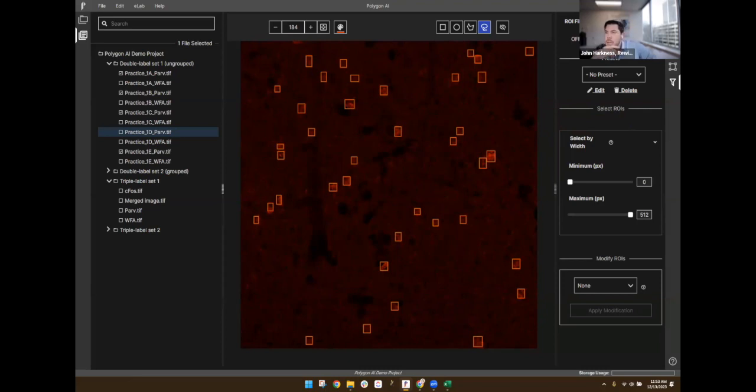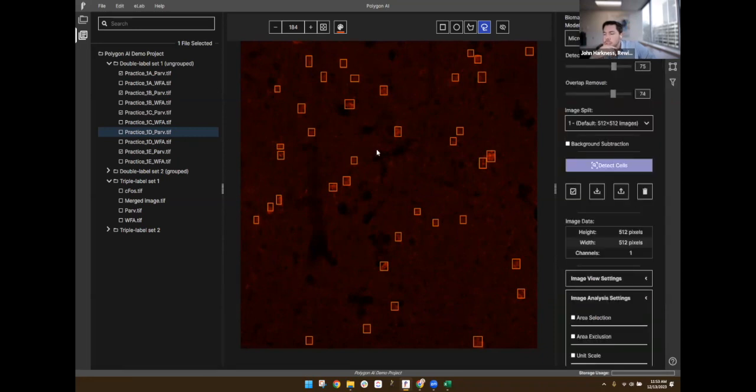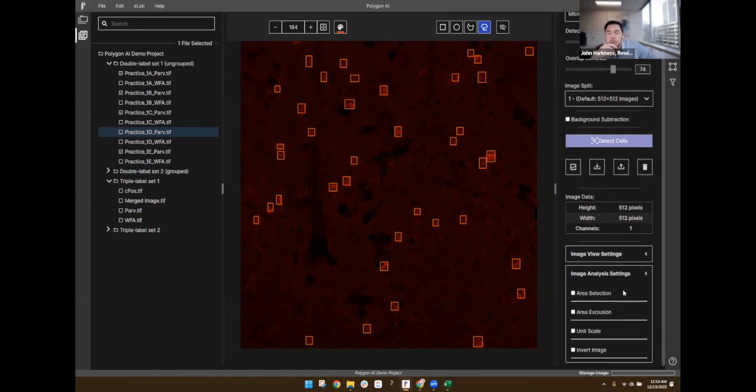Lastly, one of the tools down there is that area selection. I think that might be a good way to go about it. If you select just the inner area of the image, cutting off just a couple of pixels around the border, you're going to limit your detection to that. You can then turn off the area selection and the rest of the image is still there. So just for quantification purposes, you would not be chopping off other cells or nuclei. So that might be a good way to go about doing it. But yeah, really good question.